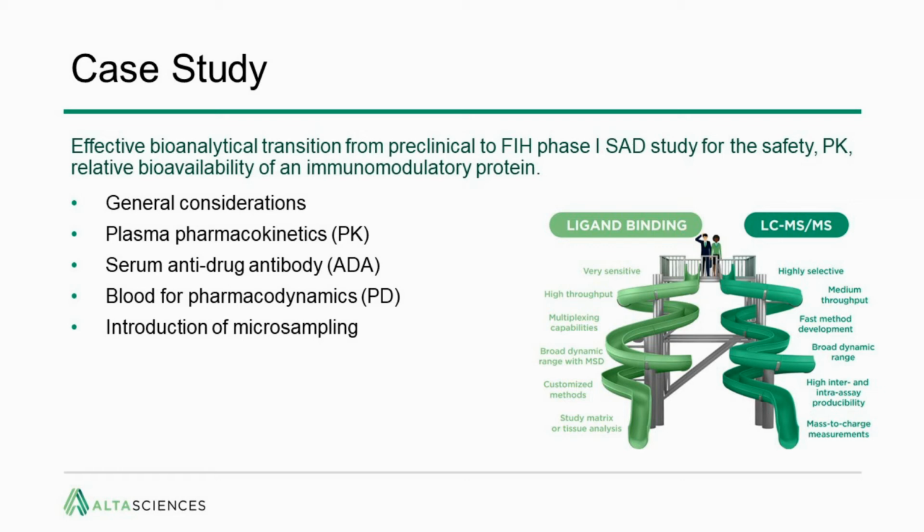One of the first considerations is the decision of what bioanalytical platform to use. Key considerations are which component of the drug should be quantified, how can pharmacokinetics and pharmacodynamics be best characterized, and which platform has the required sensitivity. In this case study, ligand binding methods were used for these assays. However, I would like to emphasize there's more and more use of mass spectrometry for biologics quantitation because of its exquisite selectivity, and often these two assays are used in conjunction to answer appropriate questions.